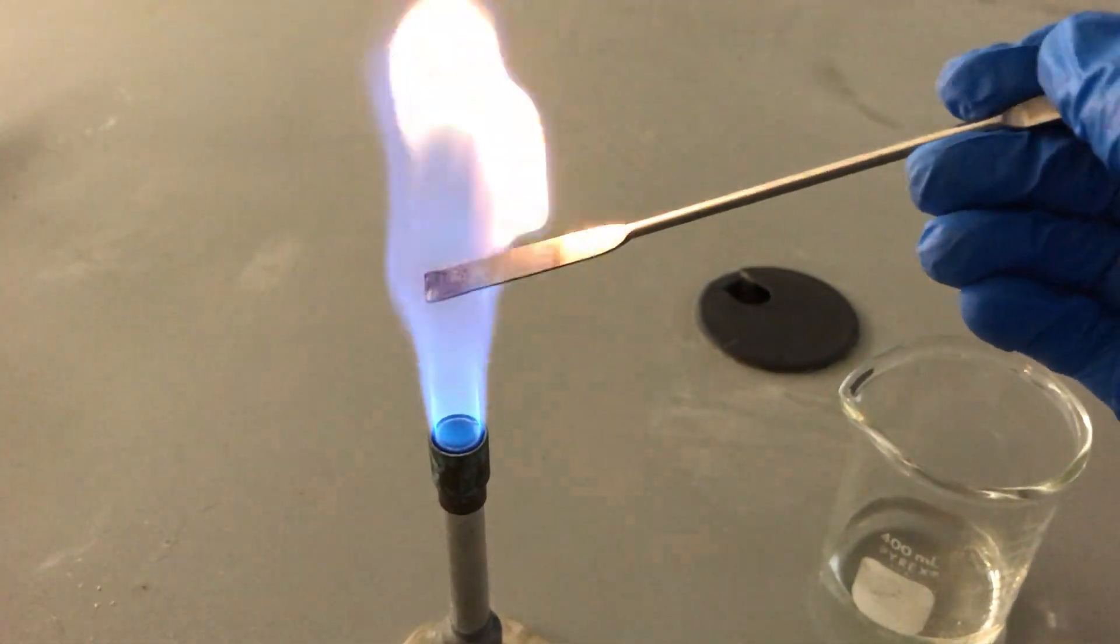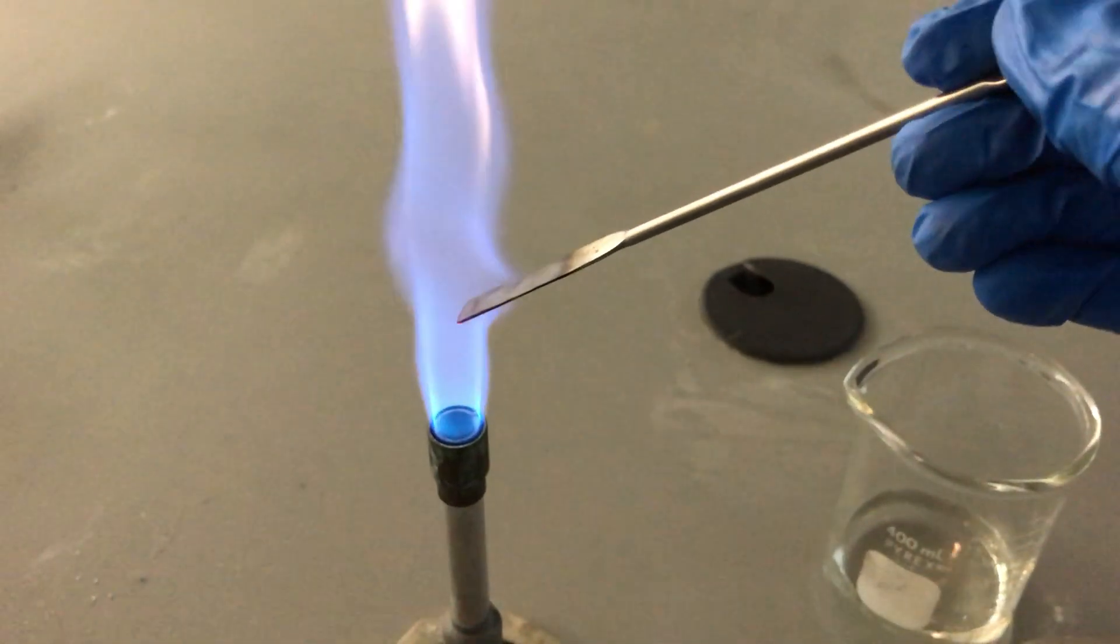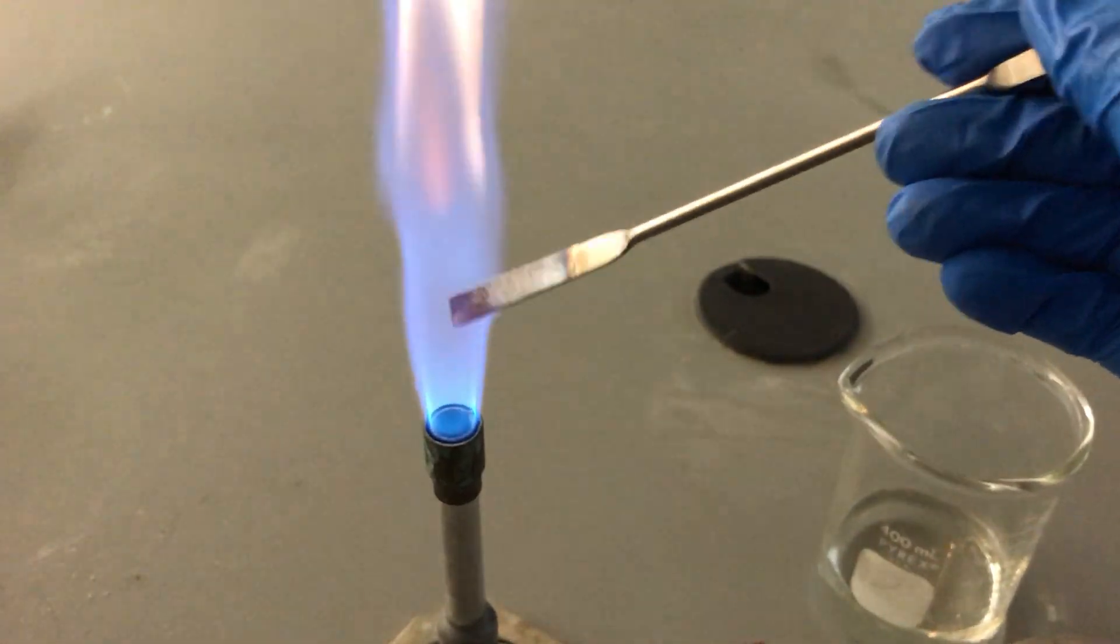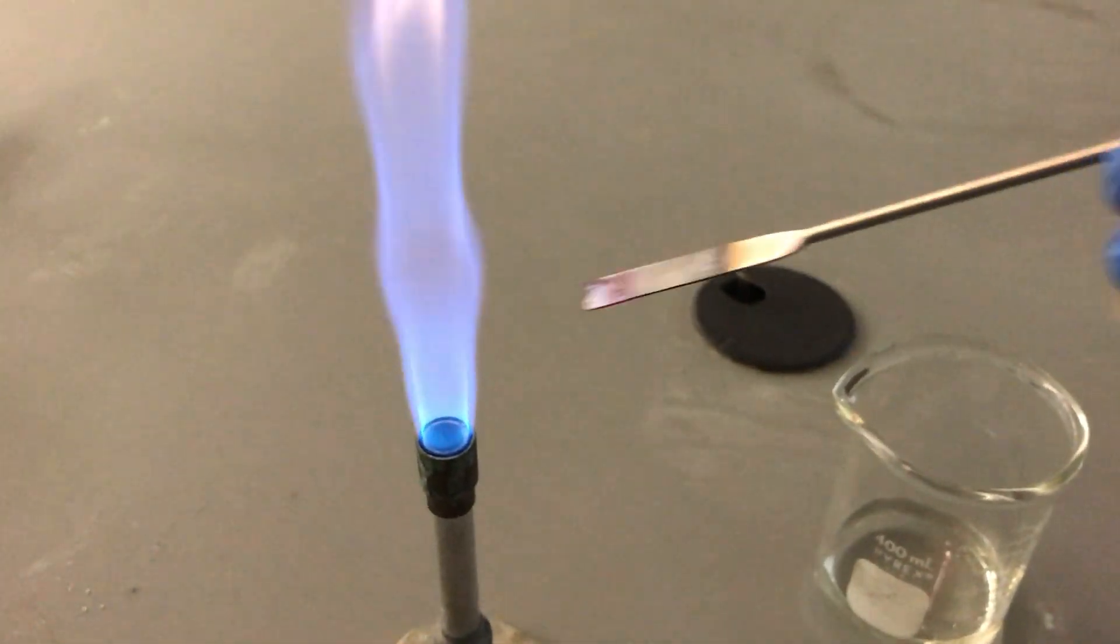So you're going to use that data, write it down on your data sheets, and then use the key in the next slide to determine what compounds are present in our sample.